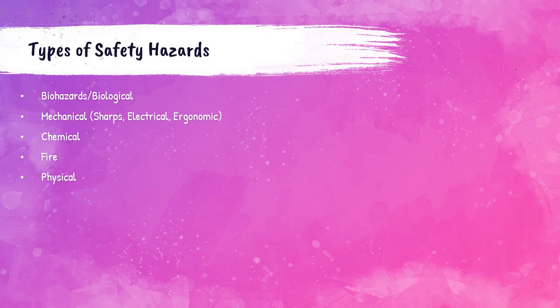There are many types of safety hazards in the clinical laboratory. The main one is biohazard — infectious microorganisms. There are also mechanical hazards including sharps like needles or glass, electrical hazards, chemical hazards from preservatives or reagents, fire hazards, and physical hazards caused by obstruction of walkways, wet floors, or improper clothing.